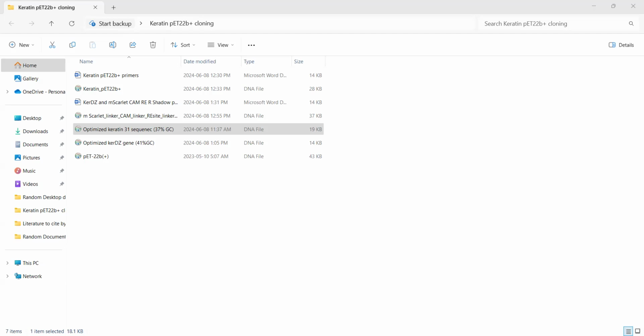Now, because these are only primers, this will anneal to your DNA. Now, for Gibson cloning, you need to design something called extensions, because of what will happen here, so let's double check. This forward primer needs to be matching, so you do Control F and you're checking whether this primer works in your map.